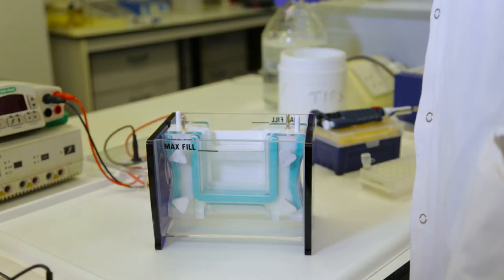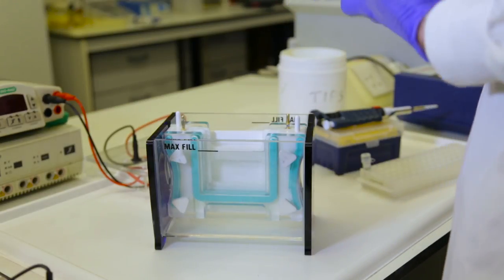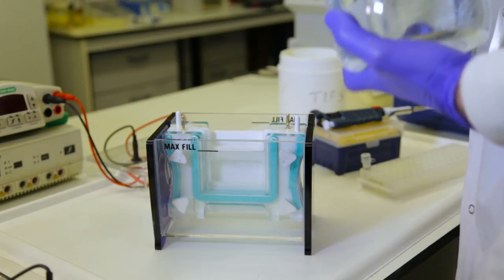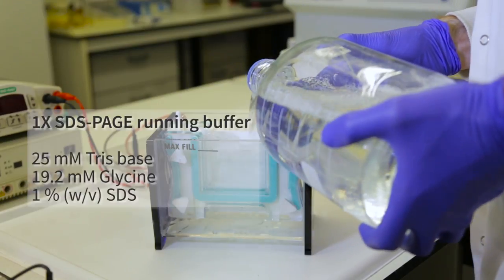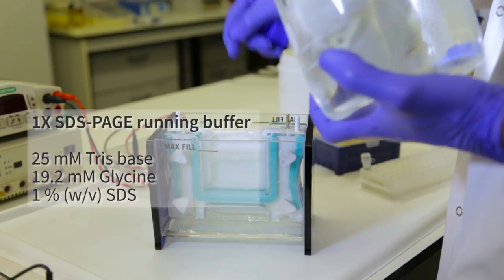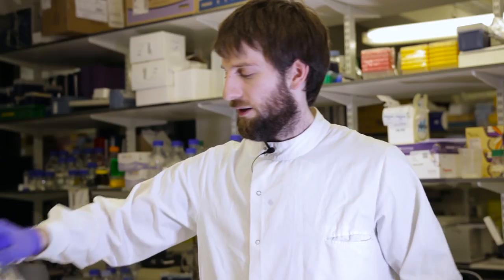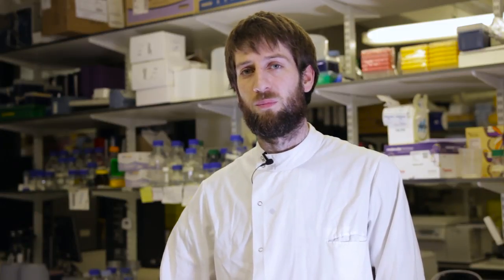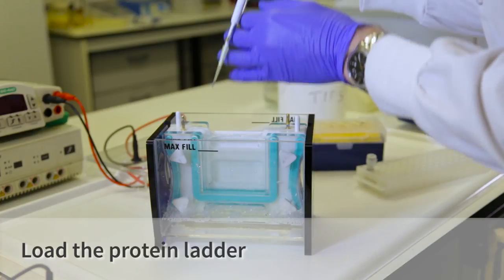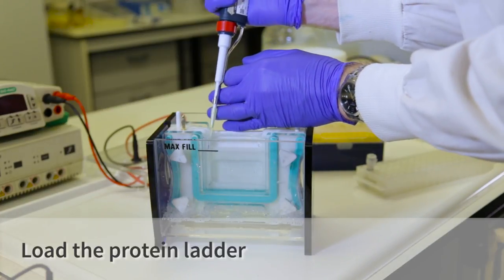To make the SDS gel tank unit, we add running buffer to the tank. This allows the current to move from the inside of the cassette through the gel down to the outside. Now the first thing we're going to load onto the gel is the protein ladder. This contains a pre-prepared mixture of proteins of specific sizes to allow us to check what size our protein is running at.